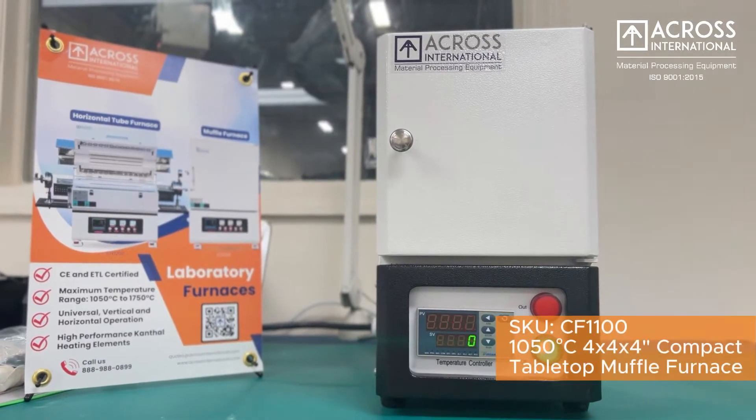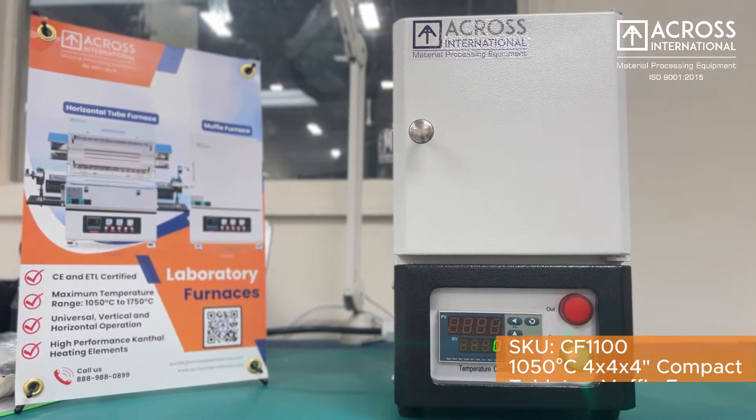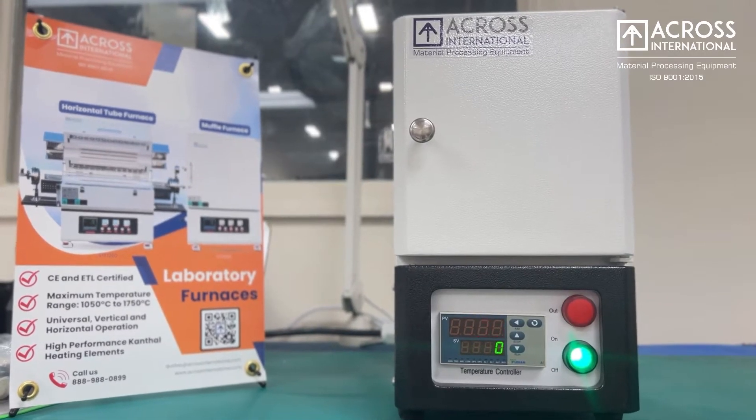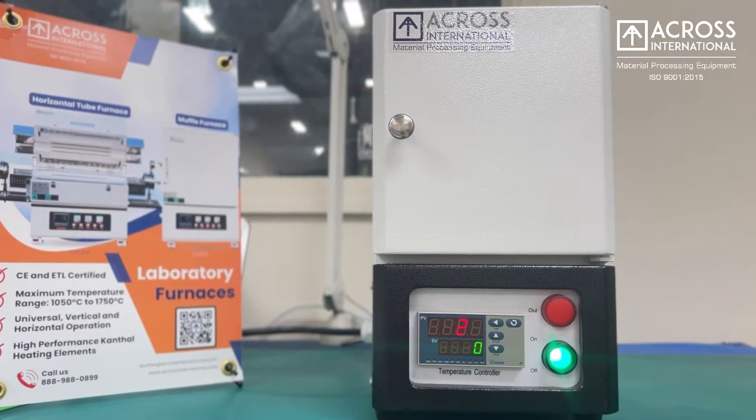Muffle furnaces, or chamber furnaces, are essential tools to a variety of industries, including research, industrial processing, and casting molds for dentistry, jewelry, and other applications.